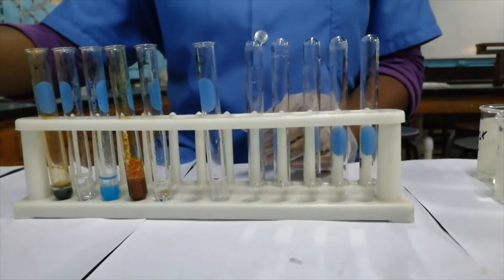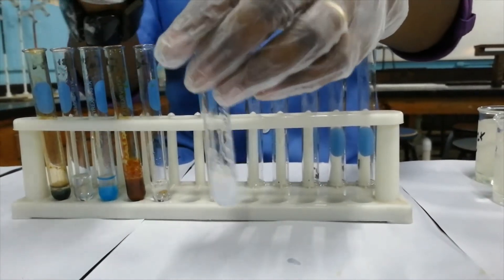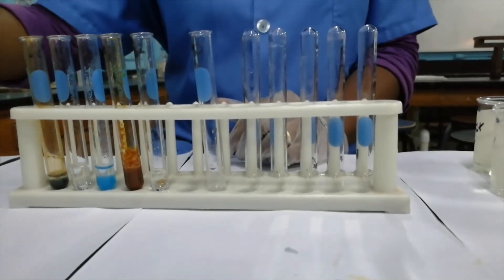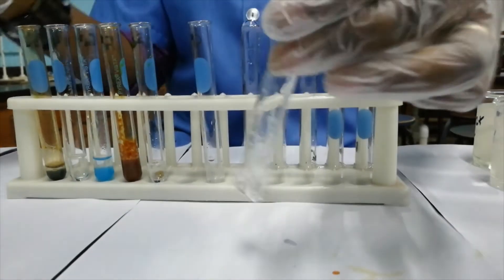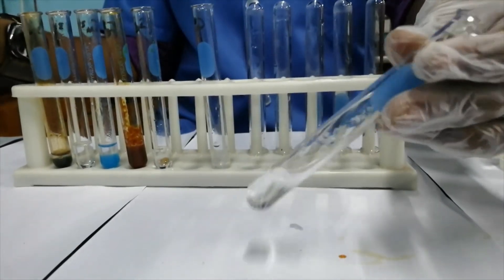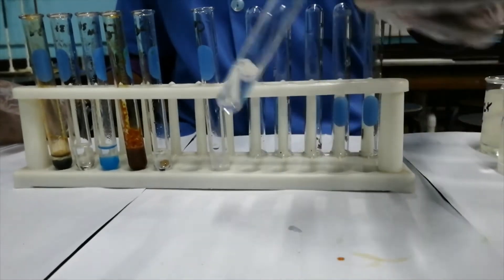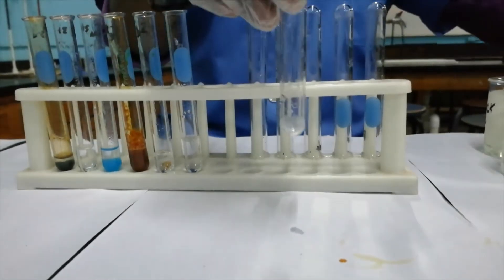If I pour off most of this precipitate and add excess sodium hydroxide solution to it, you can see that the precipitate that was formed in here is dissolving in the excess sodium hydroxide. So the Zn²⁺ cation dissolves in excess sodium hydroxide.